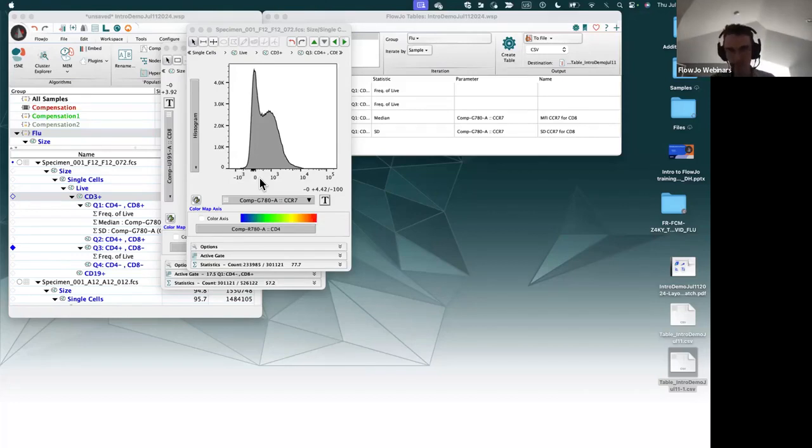They're in a logarithmic scale, which tends to be the best representation of intensity values. Like 10 to the 3 is an intensity value of 1,000. Intensity values are all relative, so depending on the cytometer, you'll see your intensity values at a different scale. Bigger isn't better. Some cytometers will just use larger numbers than others.